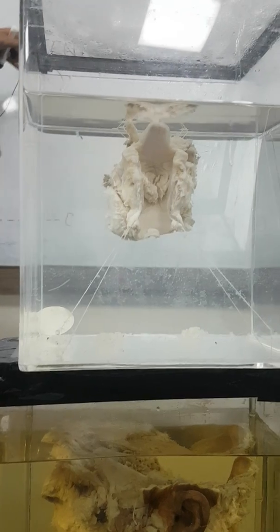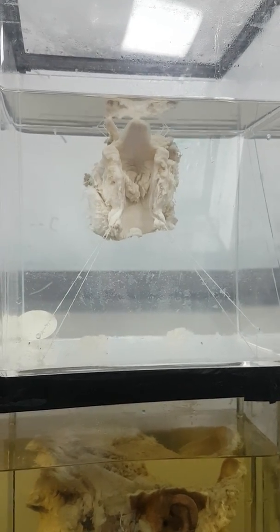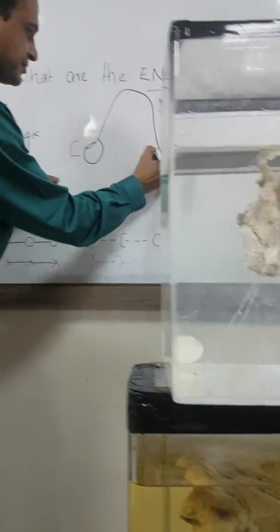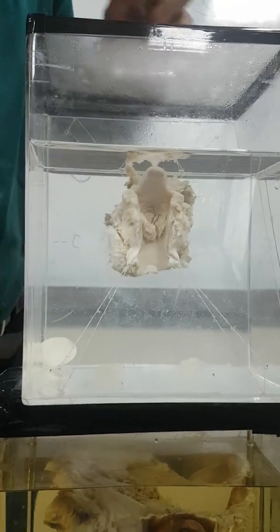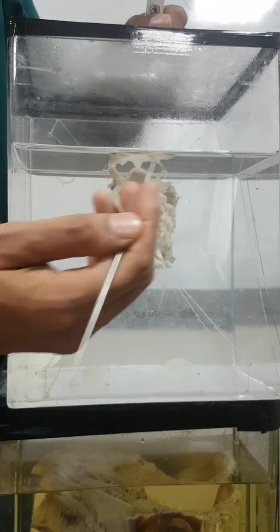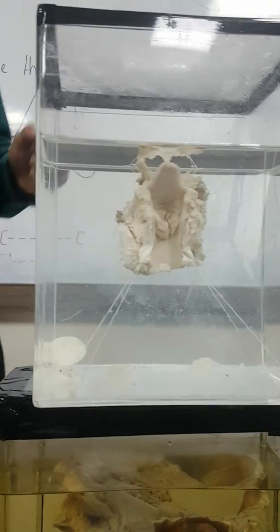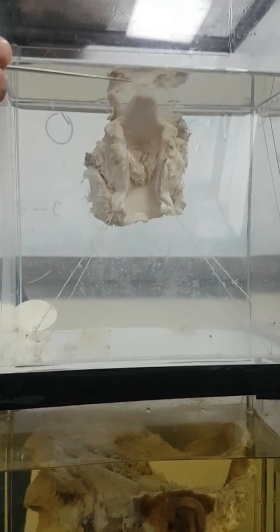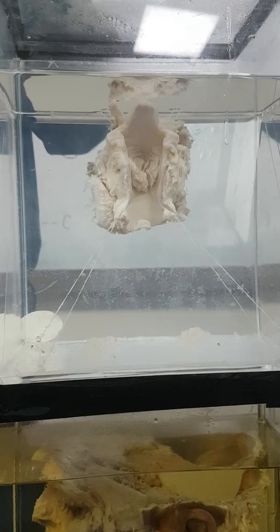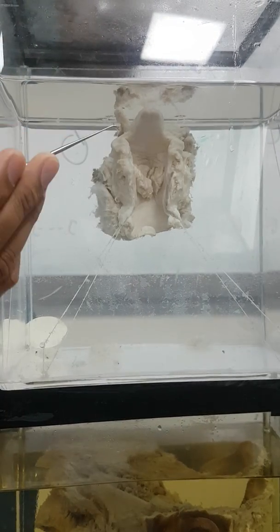The most prominent structure you are seeing here is the epiglottis. Where the epiglottis ends, you can see two prominent structures - those are the arytenoids. So epiglottis, then the arytenoids. This is the larynx which was closed and has been cut open, so we are seeing the epiglottis and the arytenoids.